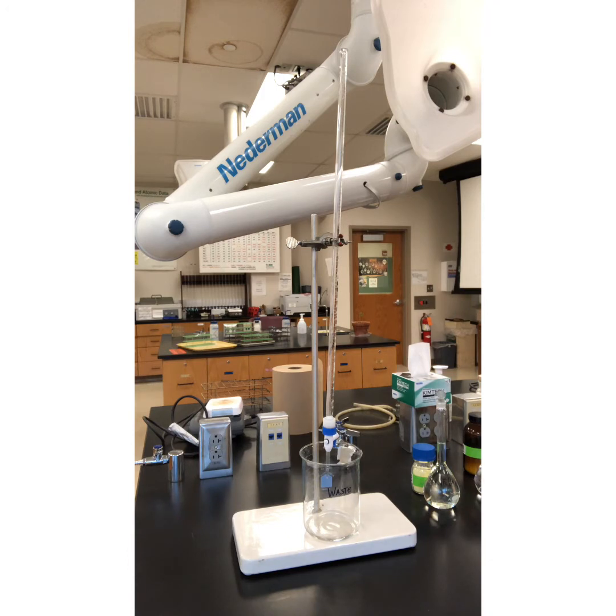So we're going to rinse the burette with 3 to 5 milliliters of the zinc sulfate solution that we have prepared. So we're going to put some of the solution in. We're going to rinse it around and swirl it around to rinse out whatever is in there. And then we're going to also allow it to flow through the stopcock and rinse out anything that could be in there, any plain water. And then we're going to replace and fill this tip of our burette with just our zinc sulfate solution before we go ahead and fill it all the way up with our zinc sulfate for our actual titrations.